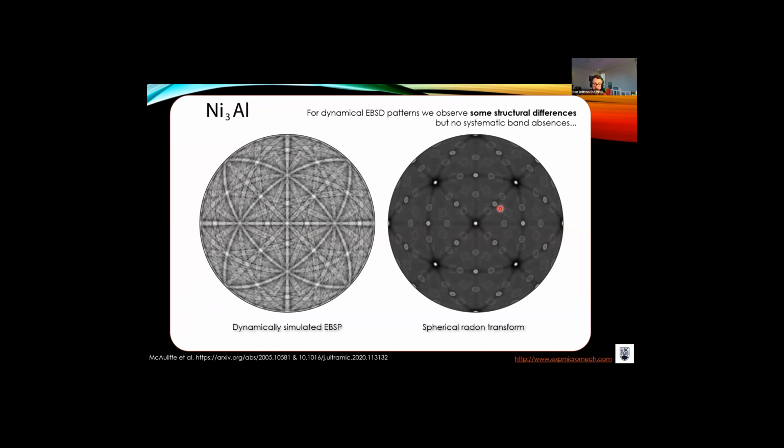The long and short of this is if I take, say, the North Pole, this circular peak at the center, the structure of this peak is described by the equatorial domain in the pattern. So the radius of this is related to the band width, and the intensity is related to the scattering of that particular band. And so I can just look, and the perpendicular great circle is described by this structure. So this tells me this is a specific crystal plane that's of interest. And again, we have open source algorithms that will do this transformation if you so wish.